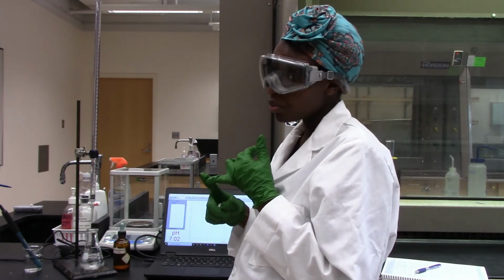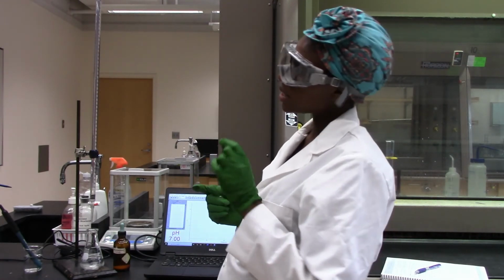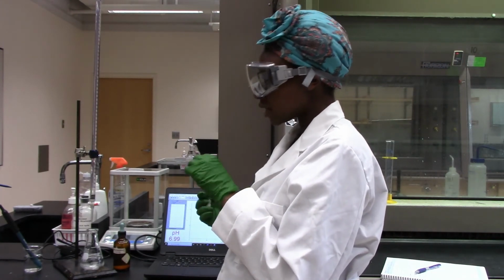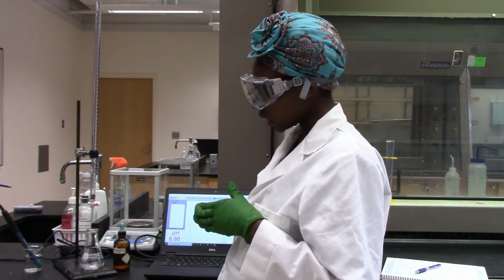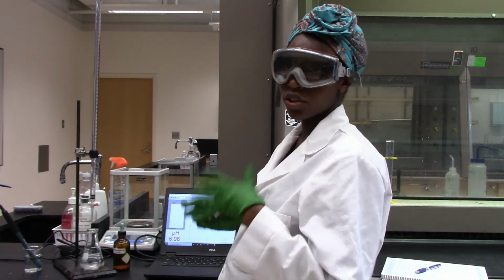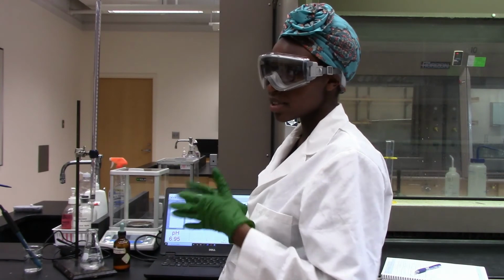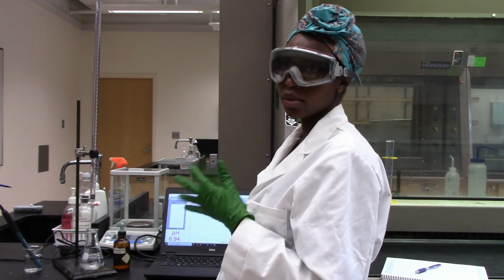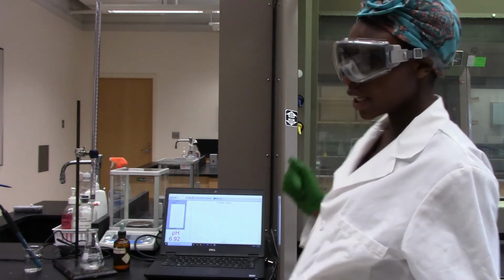Now that I know the volume of the sodium hydroxide used, and I also know the molarity, that means I can get the moles of sodium hydroxide. And that should be equal to the moles of the solution that's being titrated from start to finish. And once I know the moles of that and I know the volume, that should help me find other parameters. So if I know the moles, I can find the molecular mass, and I can also find the Ka. And that's basically what this experiment is aimed at. So for unknown number 1, we need to determine the Ka and the molar mass, because we are going to take the pH readings, which will also help with obtaining the Ka values.